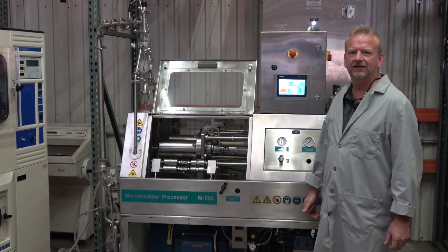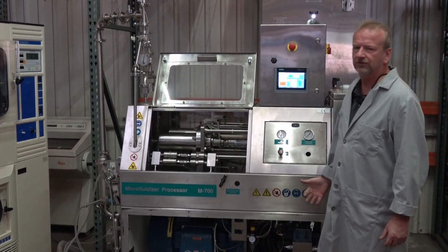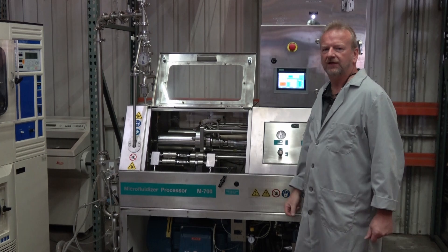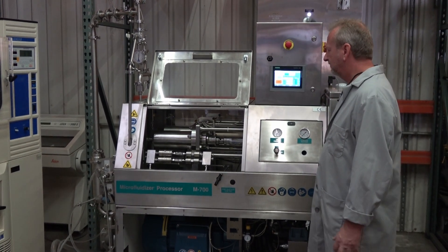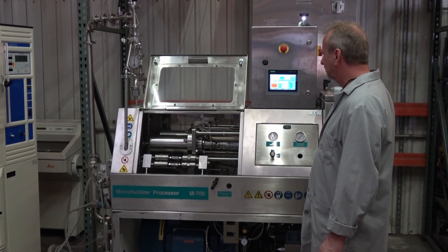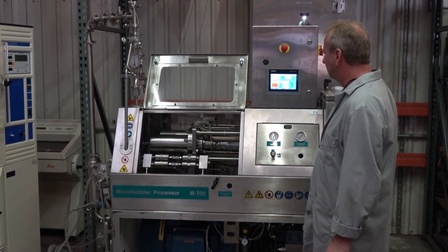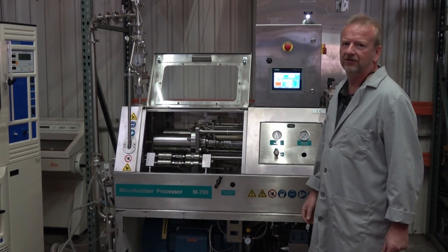Hi, I'm Rich with New Life Scientific. Today I'm out in our warehouse where we have set up this microfluidics unit. We've been working on getting it all back up to snuff — not a whole lot of issues with it, it had very low hours on it. We like to shoot these demo videos so you can actually see it in action.